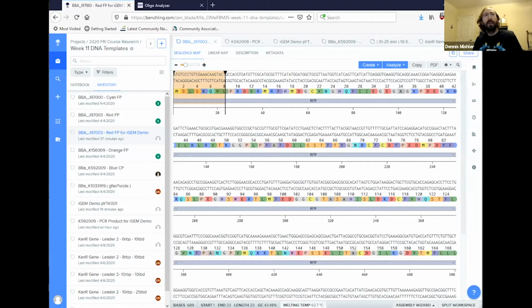And then lastly, we have this melting temperature part here. This is for the selection. So if I change the selection, you'll see a lot of the numbers at the bottom there change. So the end will change, the length, GC content, melting temperature, all these are going to start changing, right? And that's just related to the length I have, okay? But I'm going to go with 23. I chose this because I often like primers around 20 nucleotides long, and I like to have melting temperatures that are around 60 degrees or a little bit higher, all right?